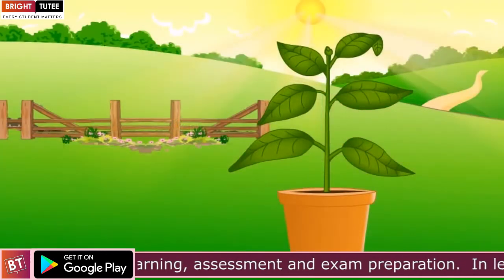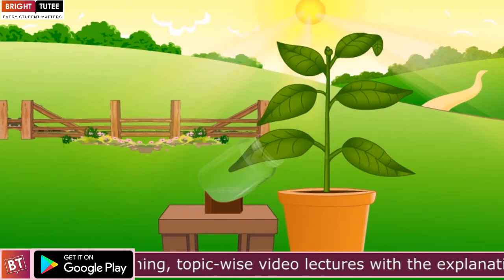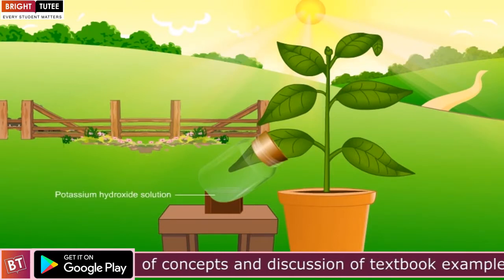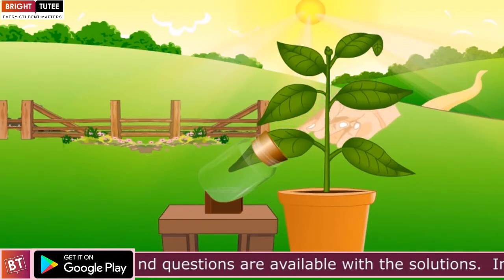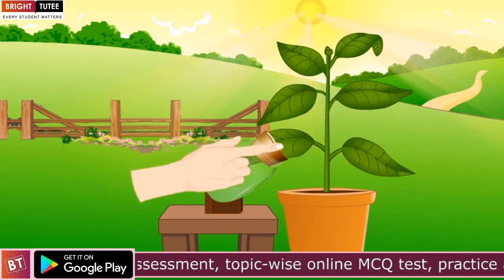Now, with the help of a split cork and a support, arrange the leaf just as shown in this figure, of a de-starched potted plant, the one which you kept in dark for 72 hours, in such a way that half of the leaf is inside the bottle. Now, on the margins, apply Vaseline, so that this jar is airtight. No more carbon dioxide can enter the jar.